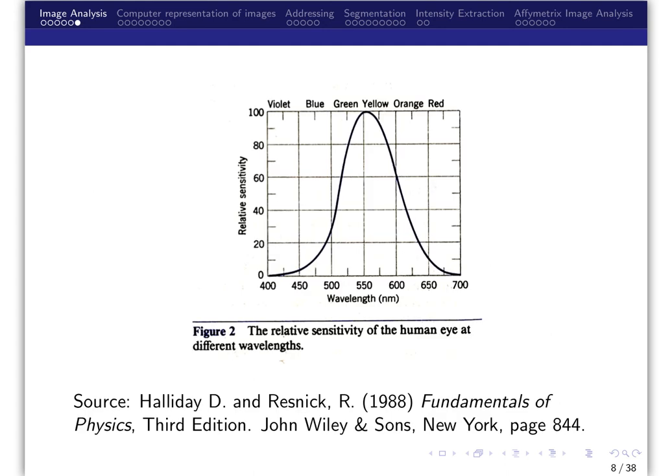Commonly, for a custom spotted array, the labels used are cyanine dyes, CY3 and CY5, which are distinguishable by the instrument scanning the array. Specifically, the emission wavelength of CY3 is between 510 and 550 nanometers, whereas the emission wavelength of CY5 is between 630 and 660 nanometers. Hence, we call these labels green and red, though they are not green and red in appearance to the naked eye. Therefore, the raw data for custom spotted arrays consists of 2 monochromatic images, one for the green dye and one for the red dye.